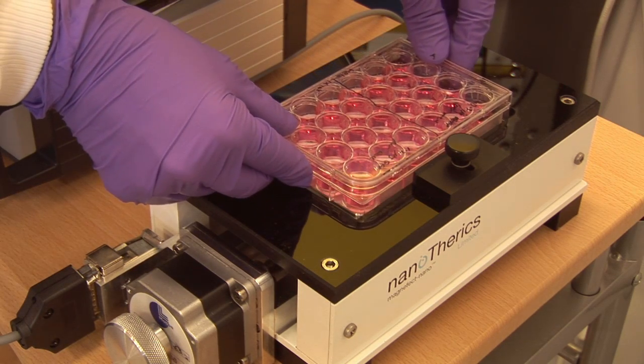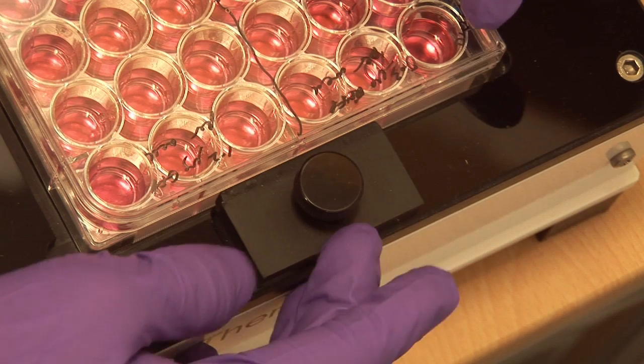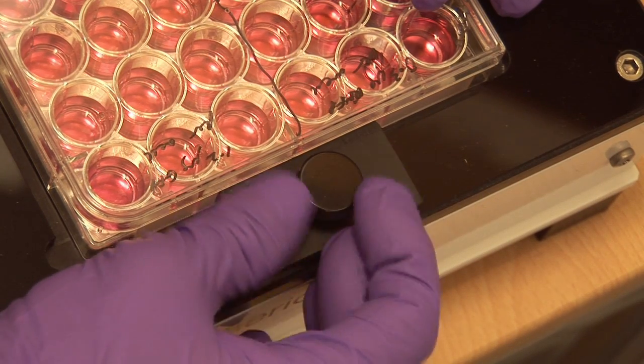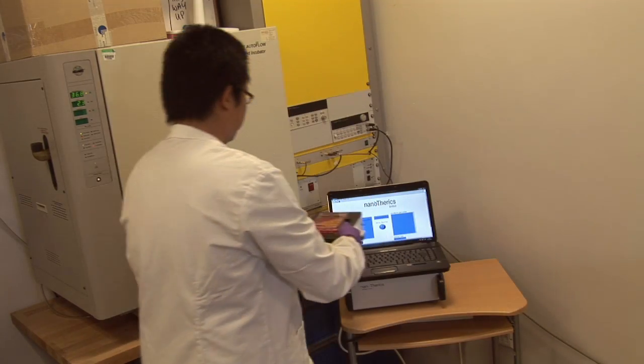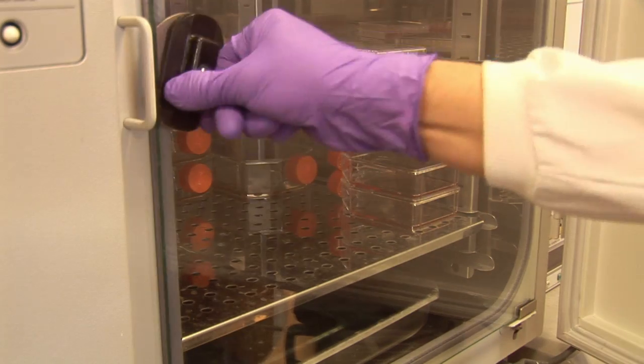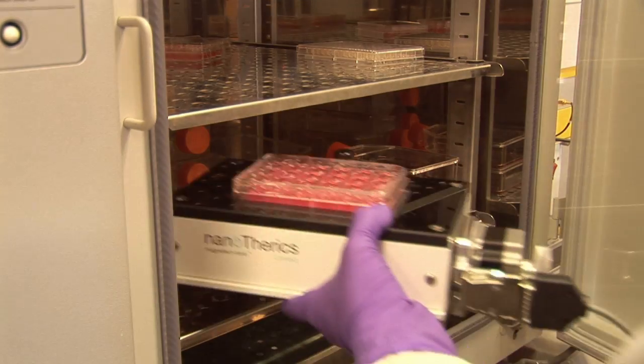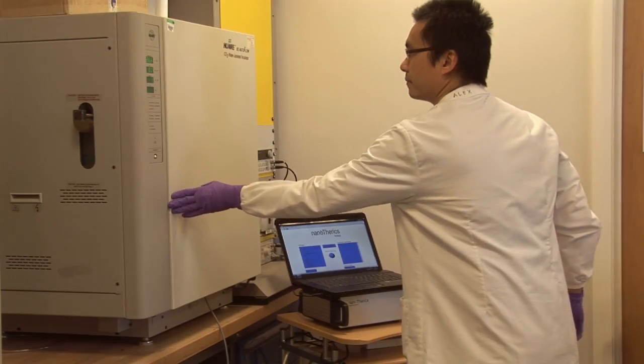Place the tissue culture plate onto the Magnafect Nano and align the wells with the magnet plates underneath and clamp in place. Now place the Magnafect Nano into an incubator for the duration of the experiment. The cable simply runs through the door of the incubator which maintains the seal.